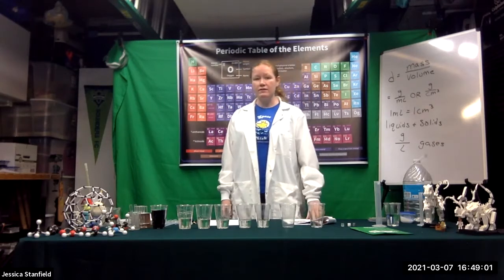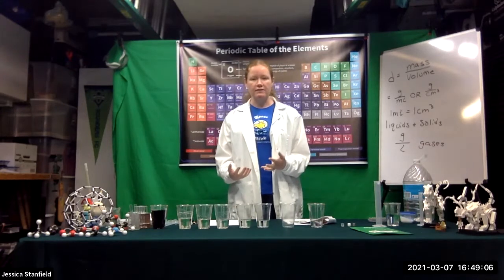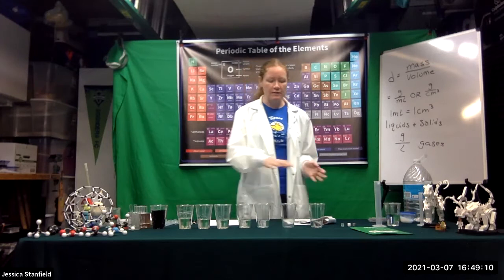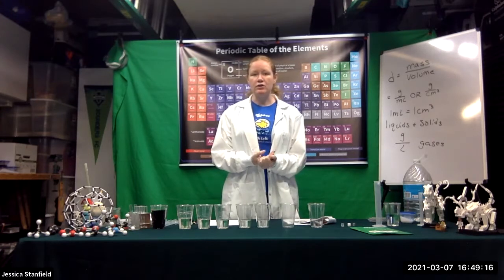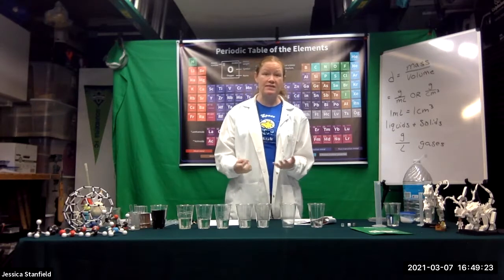All right, the non-diet beverage that contains natural sugar. We're trying to figure out the percent sugar in our beverage. We're going to be doing an experiment to get the density of several different sugar solutions. And so that's using the same sugar that would be in a natural sugar beverage. So we don't want to use an artificial sweetener like would be in a diet beverage.